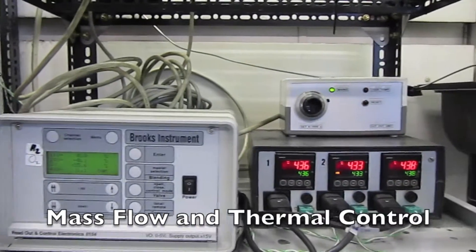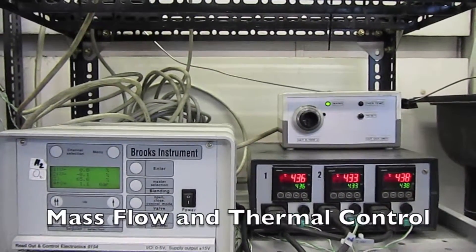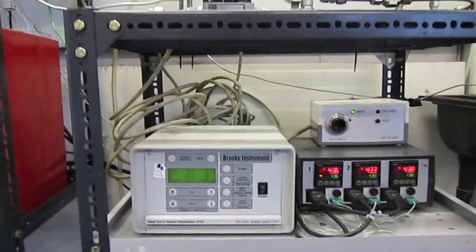Next to the flow controller unit is the furnace temperature control unit which maintains the three zone furnace at the desired temperature.